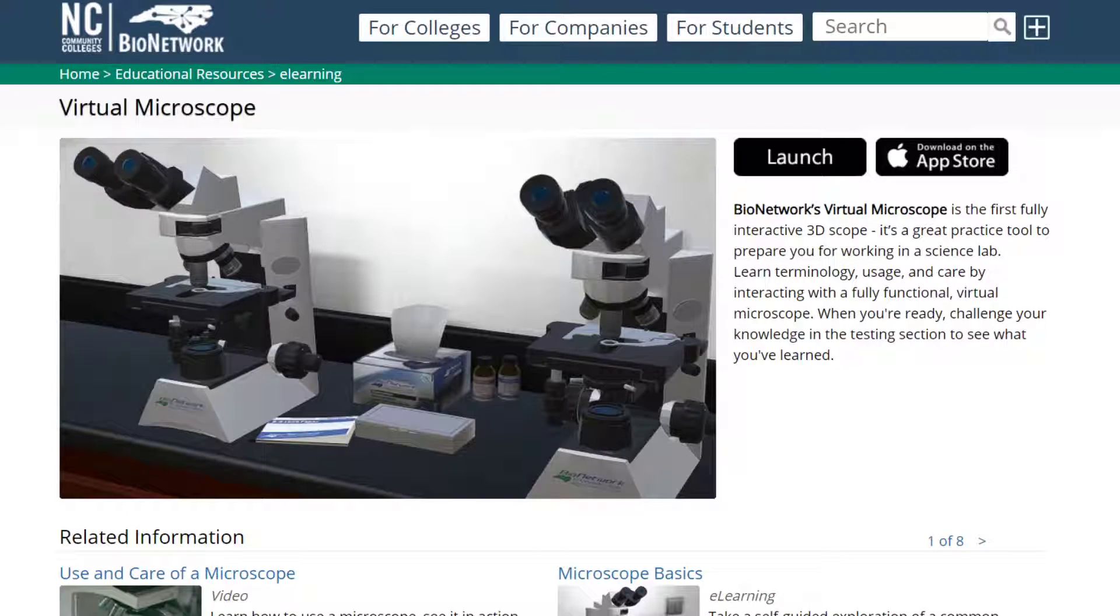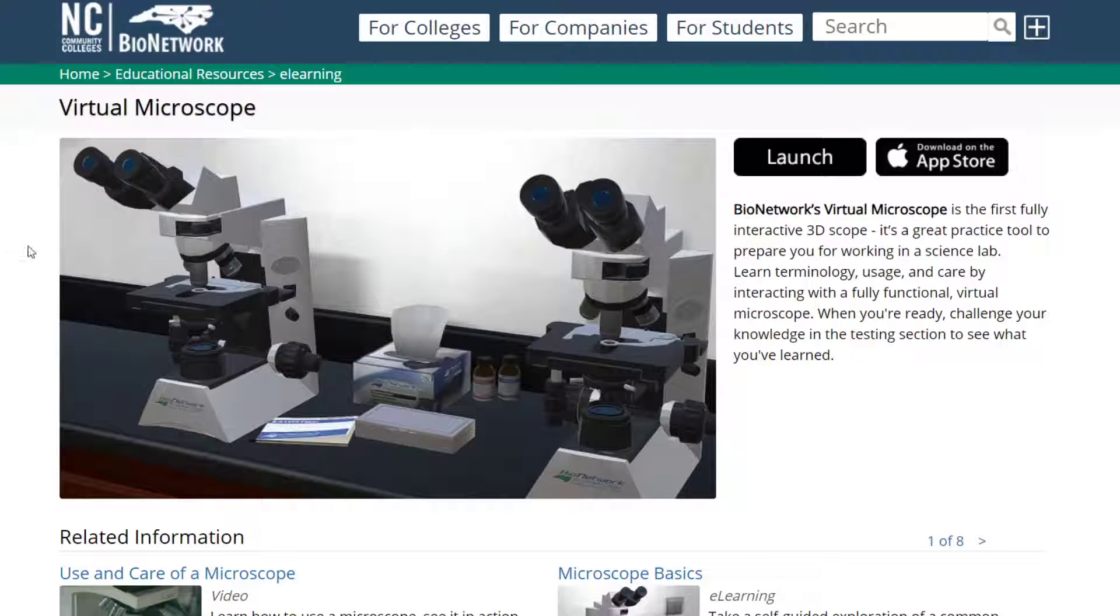Welcome middle schoolers. Today I'm going to show you how to use the virtual microscope. You can use this to learn how to use a microscope and also get a chance to look at a few different slides.